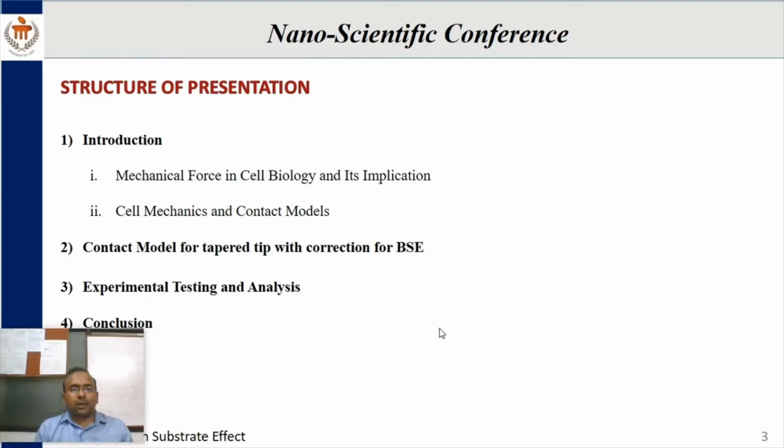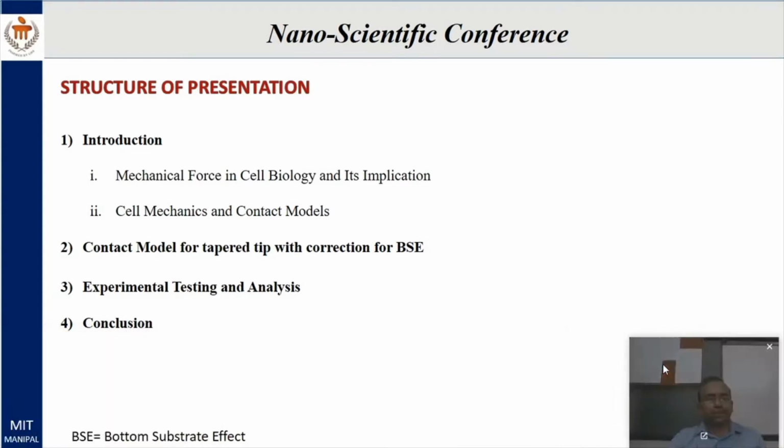Coming to the presentation, this is the structure of the presentation. Briefly, I will introduce the role of mechanical force in cell biology, cell mechanics, and the contact models. Within the contact models, we'll focus on the need for a bottom substrate effect corrected contact model, and some experimental testing and conclusion.